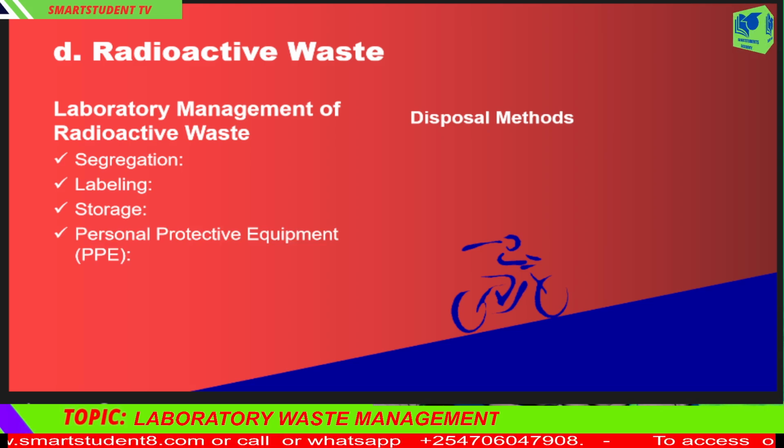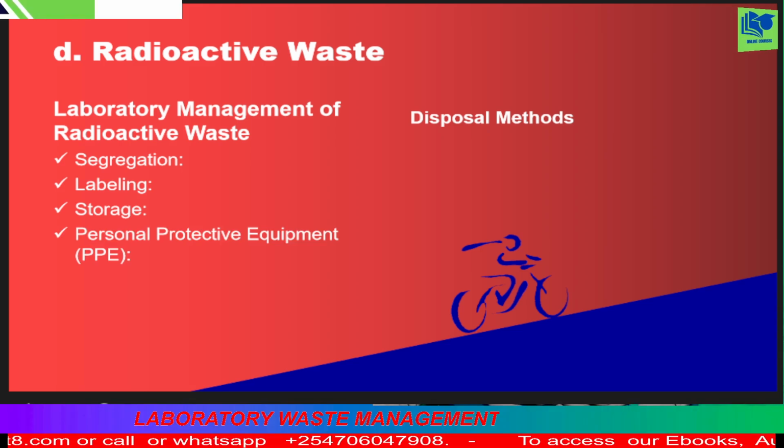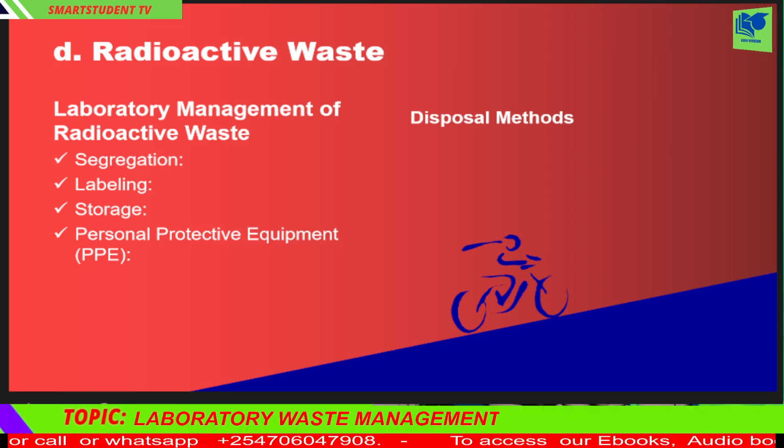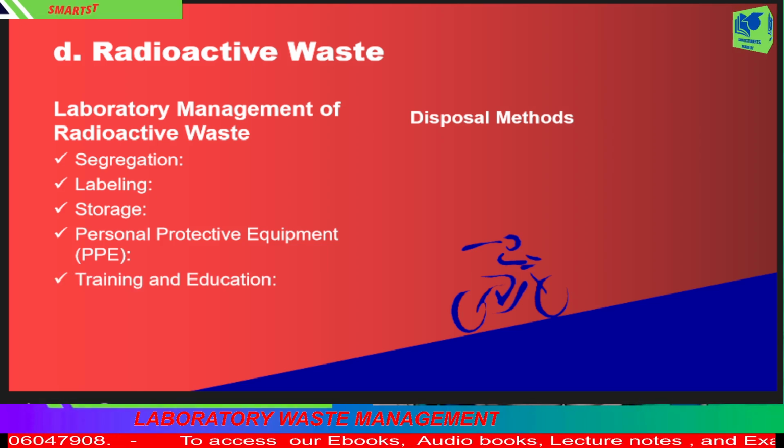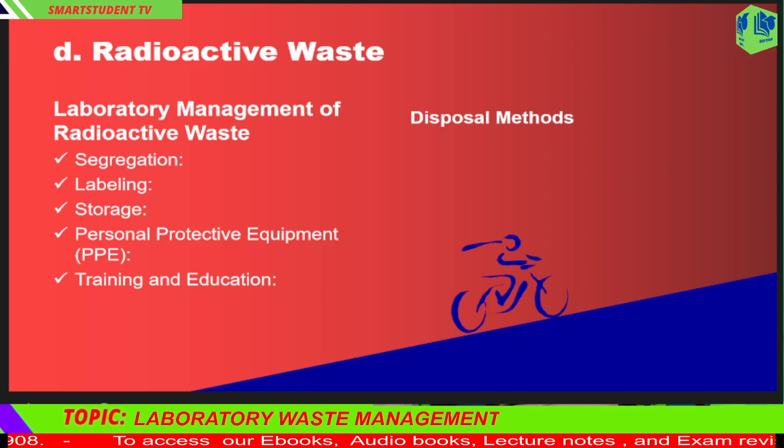4. Personal protective equipment, PPE. Lab personnel must wear appropriate PPE, including lead aprons, gloves, pocket dosimeters, and radiation film badges. 5. Training and education. Regular training on radioactive waste handling and emergency response.